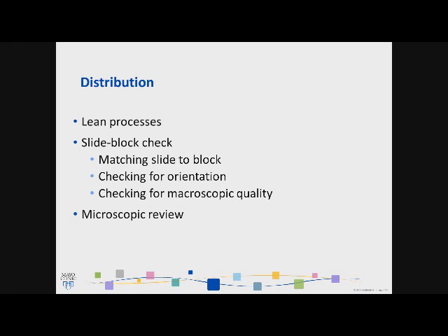We then have what we call a Pareto chart where we mark any issues that we may see, and then we take that specimen back to the original histologist to recut the specimen. While you may say, wow, that would be very frustrating if I got the case back, we have found that if the histotech knows what their issues are, they're able to improve on their processes and reduce rework. That's one thing that we find, that if we're able to improve processes and reduce rework, we're then able to improve throughput. And everybody is happier when we don't have to rework any cases.